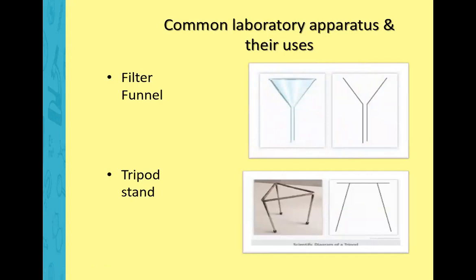A lab funnel is just like any other funnel, except that it is designed to be used in a laboratory setting. They can be made up of plastic or glass and can have either a short stem, this one, or a long stem, as it is required by us. There are several sizes that can be chosen from based on the amount of liquid that needs to go through them quickly.